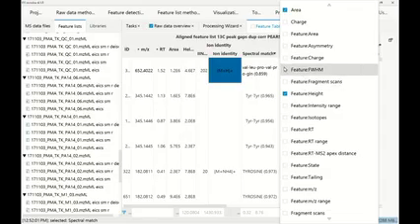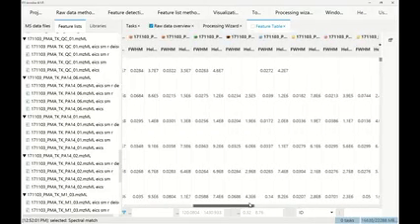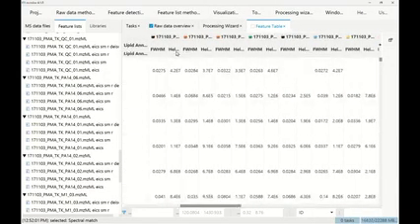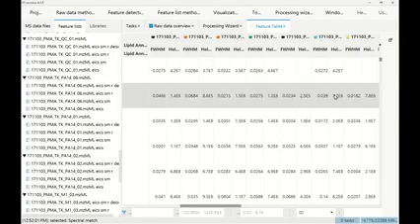But we can also look at something like the full width at half maximum, for example. This might be very interesting to optimize, like going back to our processing and then optimizing based on the full width half maximum. And you can see here that for each sample, we now have the full width half maximum in minutes also provided. And we can use this basically for the resolving of features.